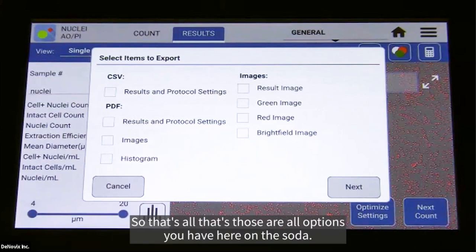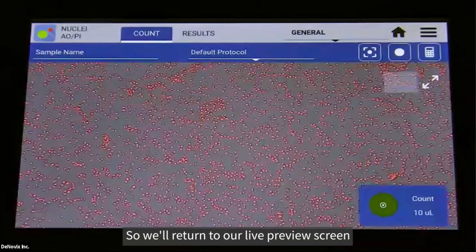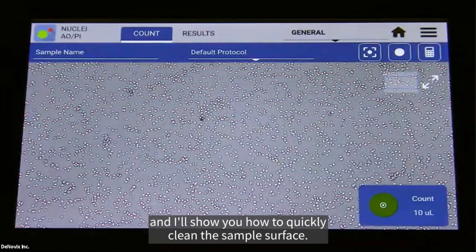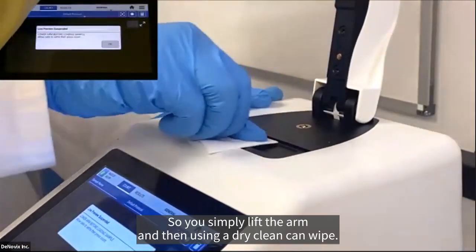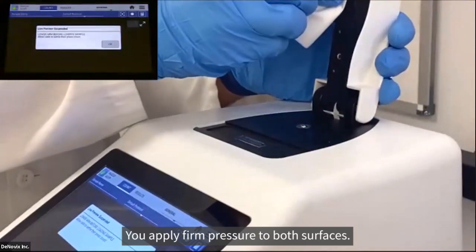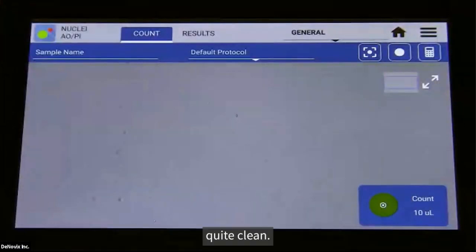So those are all options you have here on the Celldrop. And when you're finally done analyzing your sample, you would just hit next count. So we'll return to our live preview screen, and I'll show you how to quickly clean the sample surfaces. It's quite an easy protocol. You simply lift the arm, and then using a dry, clean Kim wipe, you apply firm pressure to both surfaces. And when I lower the arm again, you can see that the live preview is quite clean.